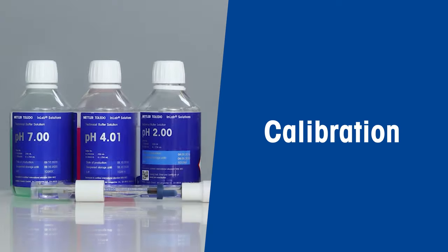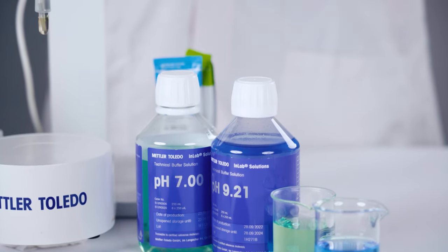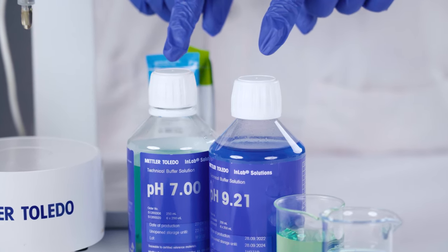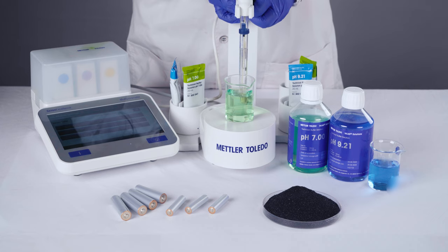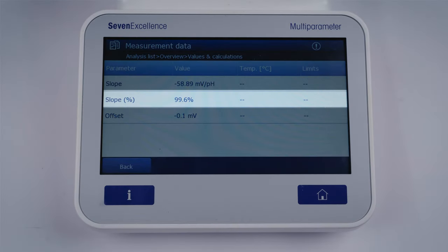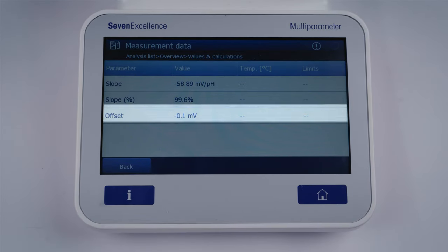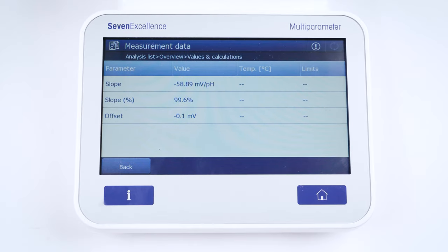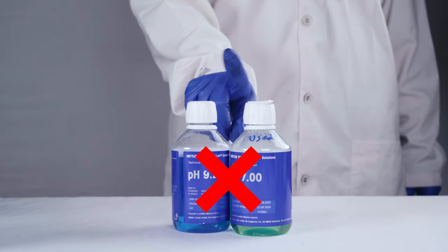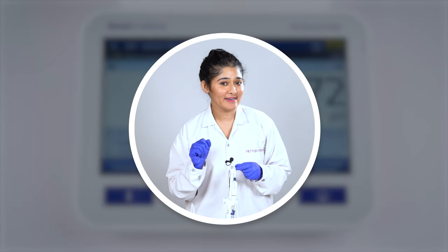Let's shift our focus to some real lab work and dive into calibration. You want to make sure your sensor is calibrated regularly using Mettler Toledo standard pH buffer solutions. When calibrating, make sure these pH buffers bracket the expected sample pH. A slope of 95 to 105 percent and an offset of 0 millivolts plus or minus 20 millivolts confirm that your electrode is doing its job properly. And don't forget to always use fresh pH buffers of high quality.